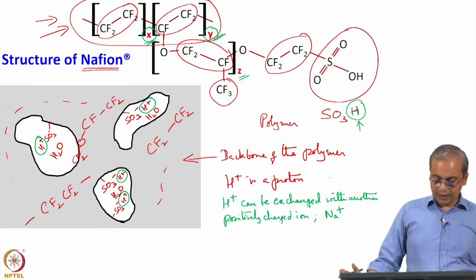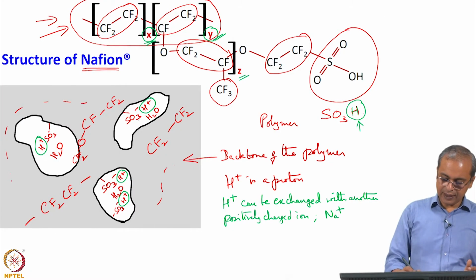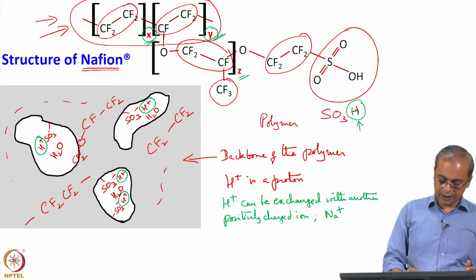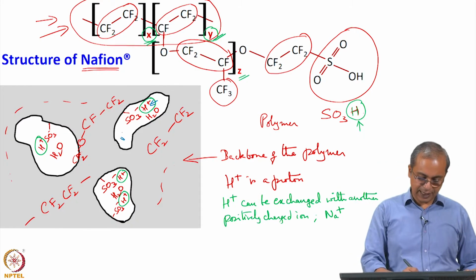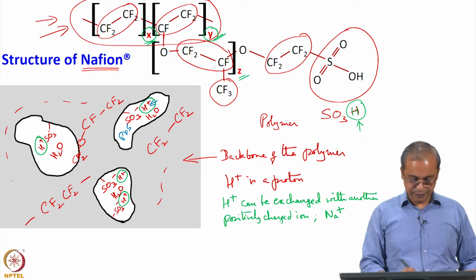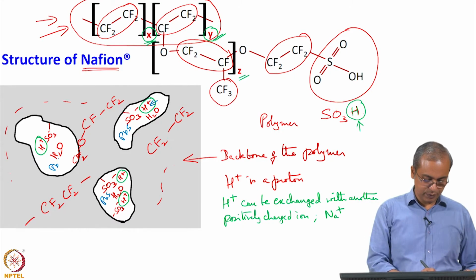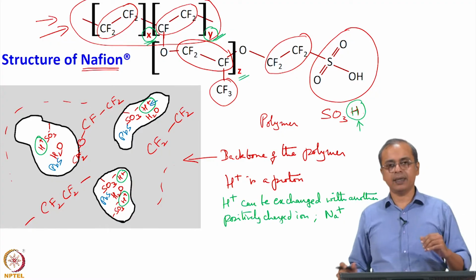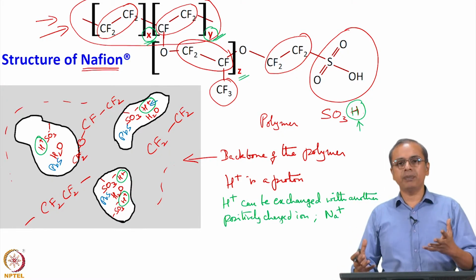So, now you have lead sulphide that has been formed in this membrane, and what we have to see here is that if you go back to the structure, it means now that you have the lead salt here. In this region, where you had this H+, now the H+ got replaced by Pb2+, and then you basically have PbS here. Okay, so, that is how you get lead sulphide in this material.